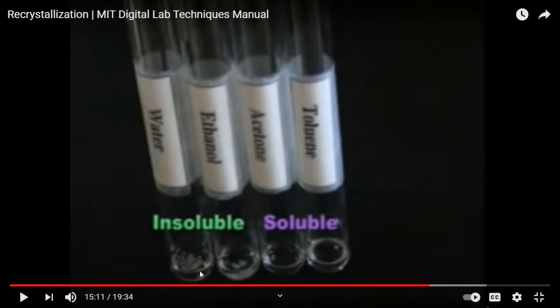I think crystallization is the only method out of all the methods you have seen or will be seeing that can give you that purity. 99.99% pure is something we can take as a medicine, something you put on the baby's skin, anything that goes into the diaper of the baby, that kind of stuff. It has to be recrystallized.